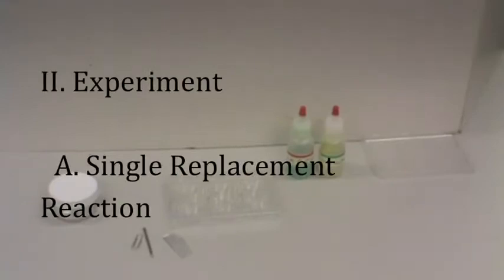VSVS team members will distribute the following materials: 1 dropper bottle of 0.1 molar copper chloride, 1 dropper bottle of 0.1 molar sodium phosphate, 1 strip of aluminum, 1 paper clip, and 1 steel nail. Tell students to use wells 1, 2, and 3. Fill wells 1, 2, and 3 with copper(II) chloride halfway.